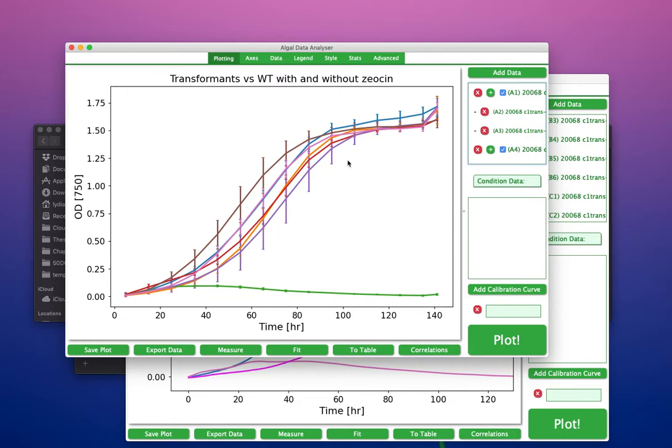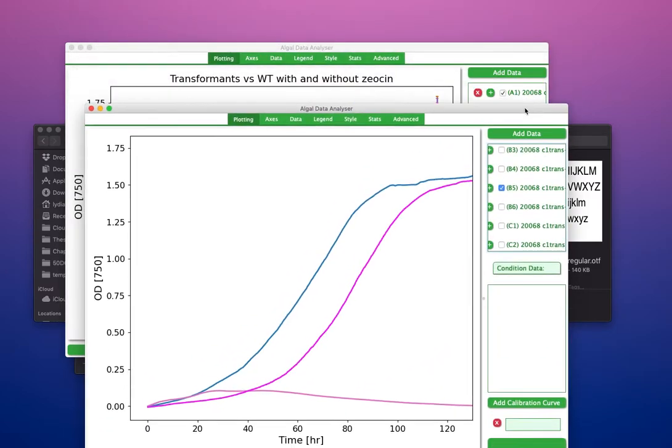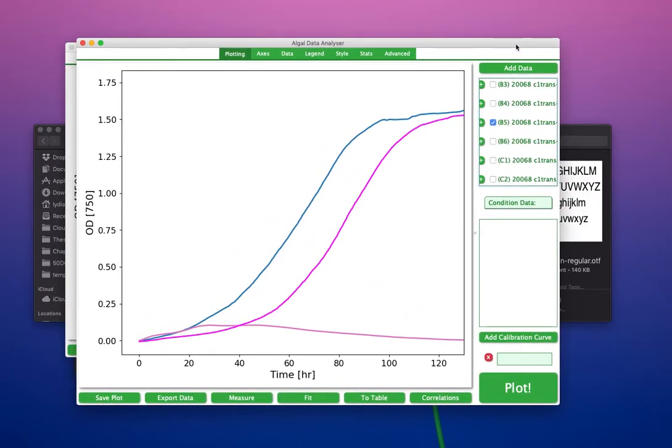And what I prefer to do is analyse the growth rates of each run separately and then average them and then work out standard error or standard deviation on them. So in order to do that, you want to load all of your HU24 plots up together as individual runs. And you want to make sure that the model actually does fit these runs, because if it doesn't fit, then obviously it's going to give you an invalid result and you can't use that to compare them.